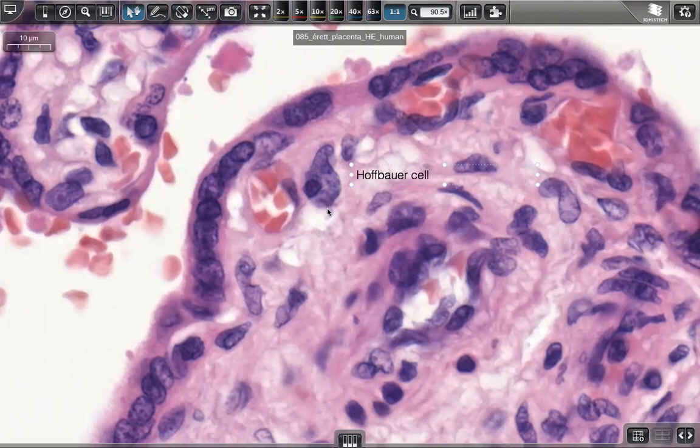It eliminates the old and degenerated connective tissue cells. So if you can find a huge cell in the mesenchyme, that is a macrophage.